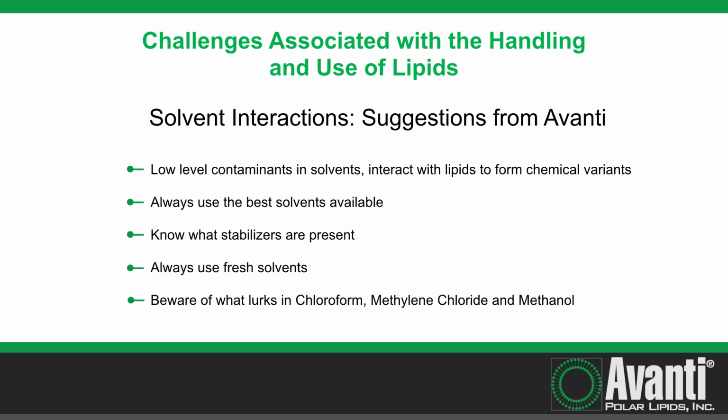You really need to use the best solvents you can buy. And surprisingly, sometimes what you think is the best solvent is not the best solvent. This sort of feature we'll talk about a little bit because of the presence of some stabilizers, which you may think just add impurities, but in fact are really critically important. The other thing is you always want to use fresh solvents. The problems we get with solvents often appear with storage of solvents, exposure to light, for example. And so minimizing that by using just fresh solvents is really quite important.